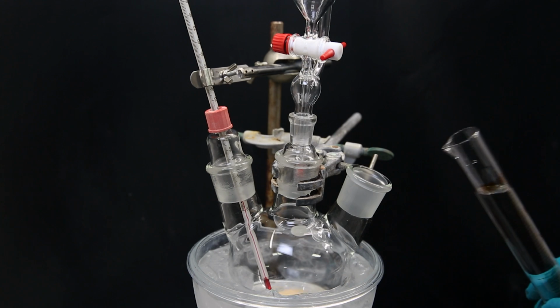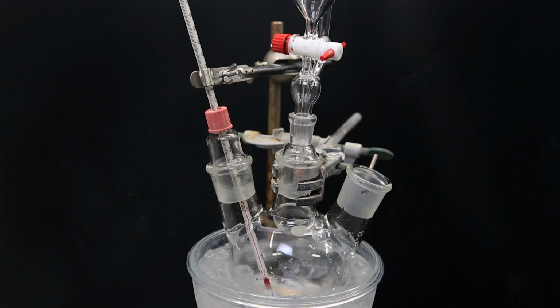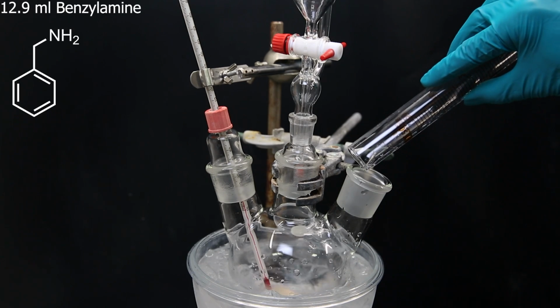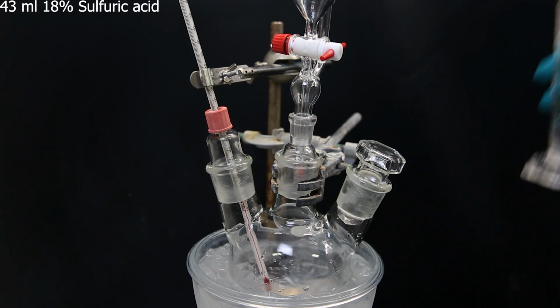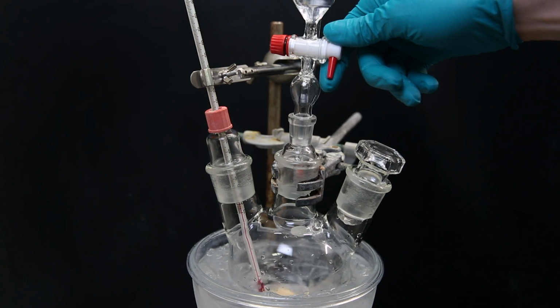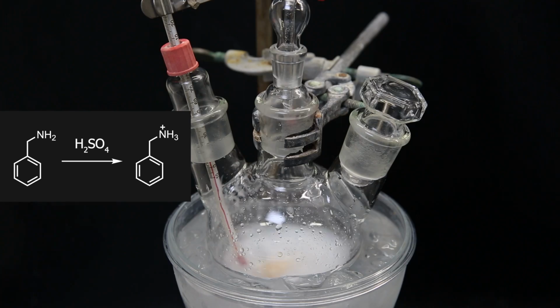Now through the open neck, I add in 50 ml of deionized water as a solvent. Then I add in 12.9 ml of benzylamine as the first reagent. Then to the dropping funnel, I add 43 ml of 18% sulfuric acid. Now I dropwise add the sulfuric acid while keeping the temperature between 4 and 8 °C. During the addition, the solution turns milky, but it became clear again towards the end.